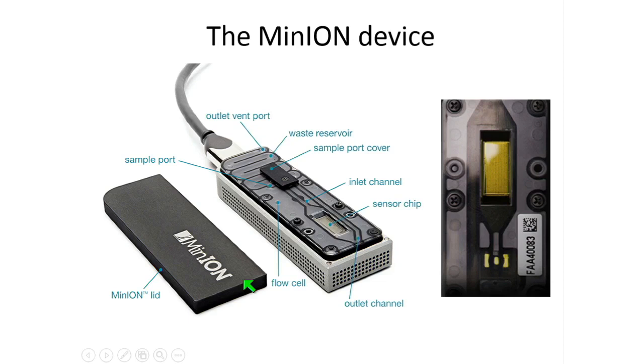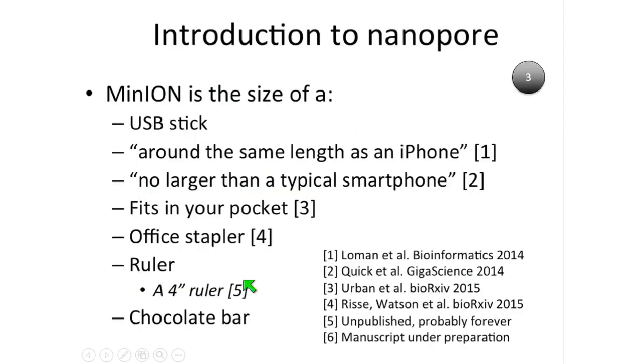So can I just have a little show of hands in terms of who's actually got one of these or has used one of these? Okay, about five of you maybe. Okay, have you heard of these things? Who's heard of them? Okay, good. So you know that this is a USB-connected sequencer, and it's extremely portable.